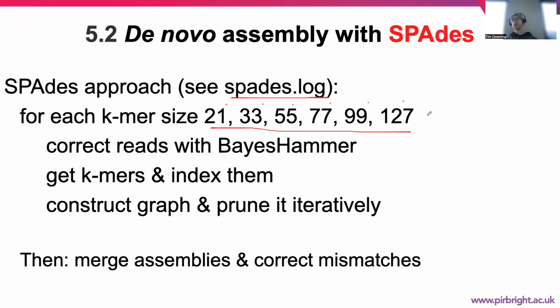And with viral genome sequence data, you can use longer, more unique k-mers, and you could provide a wider span of them because it will run very quickly. It might take maybe 4 minutes on your data, give or take, to run. So it is possible to give it more k-mers, particularly more unique ones, to see if that works better.